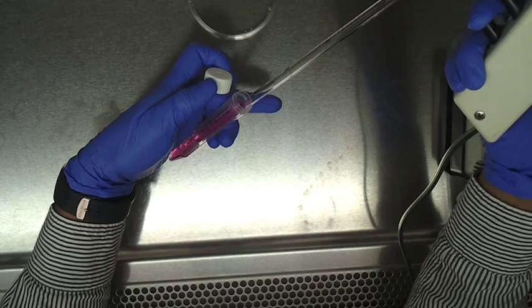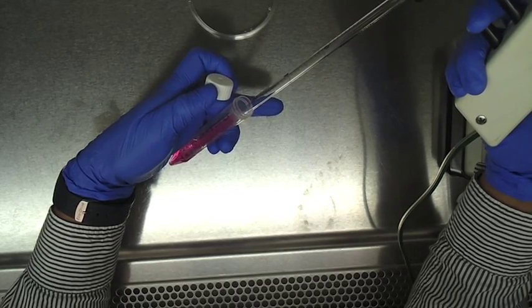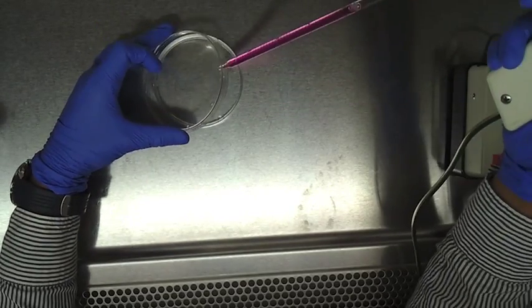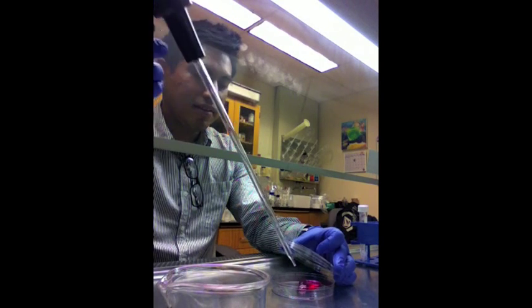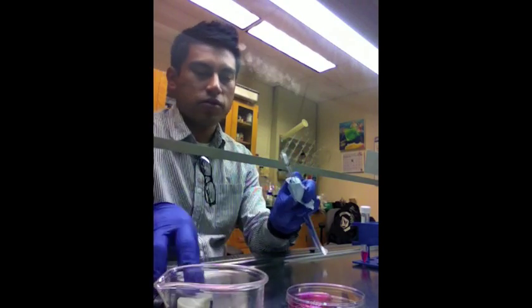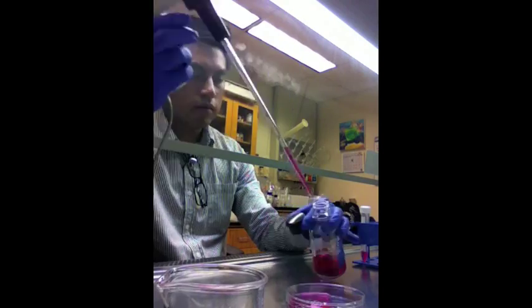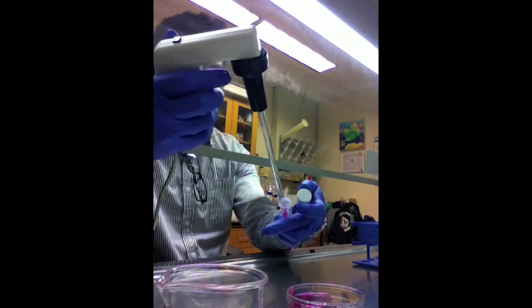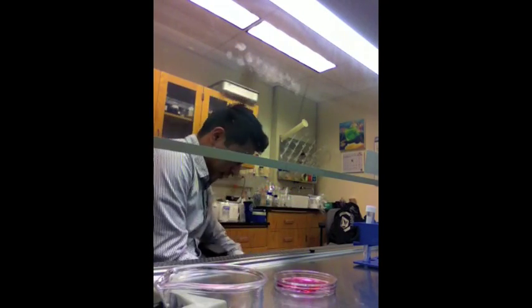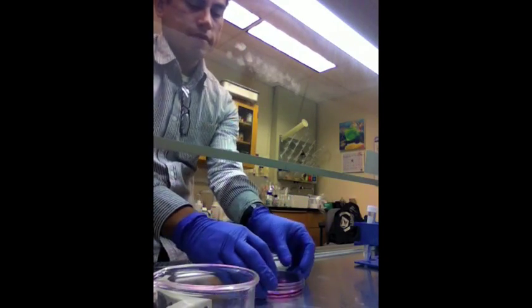This is then resuspended by pipetting up and down. The final 10ml of the culture is then added to the dish. Once completed, everything in the hood is closed and shut, and the culture dish is then taken to the incubator.